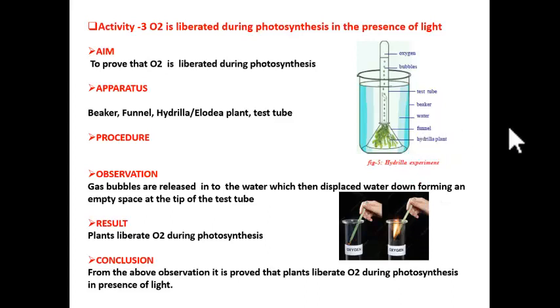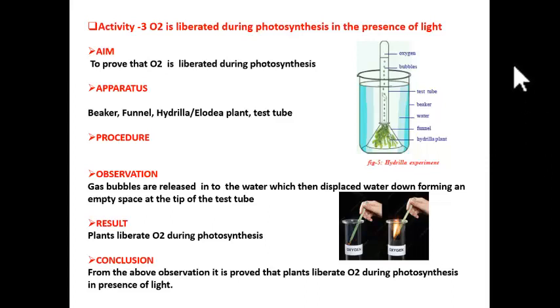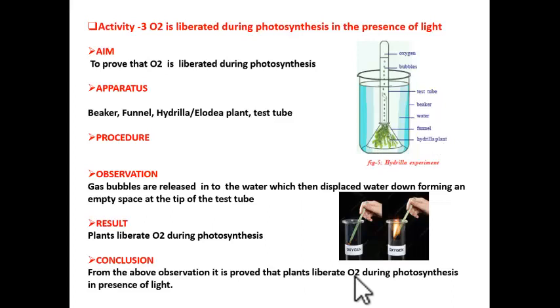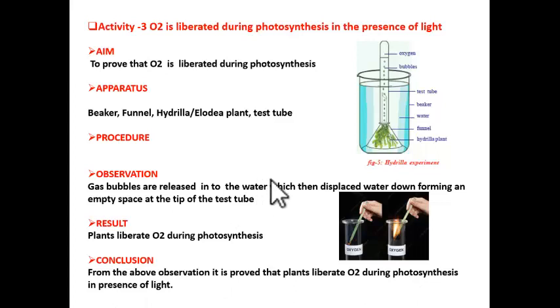Now, in the case of the setup placed in the dark, we don't observe any bubbles rising up. So from this we can simply say that plants produce or liberate oxygen during photosynthesis only in the presence of light. I hope you understood this experiment.